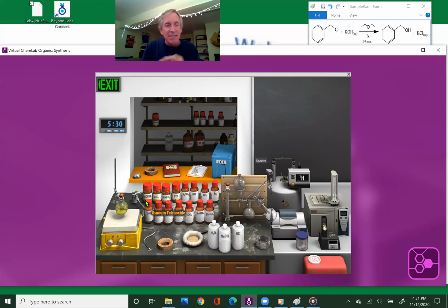Another 15 minutes of your life. Okay, so now I'm ready to do synthesis on these reactants. And synthesis requires me to do a reflux reaction under nitrogen. This is a technique that, again, I want you to go look in the appendix for to see what reflux is all about and how it is going to be similar and different.